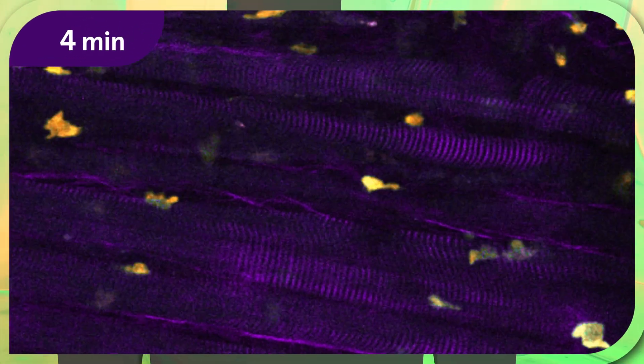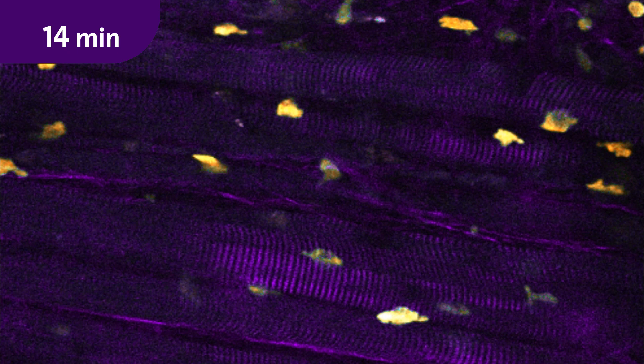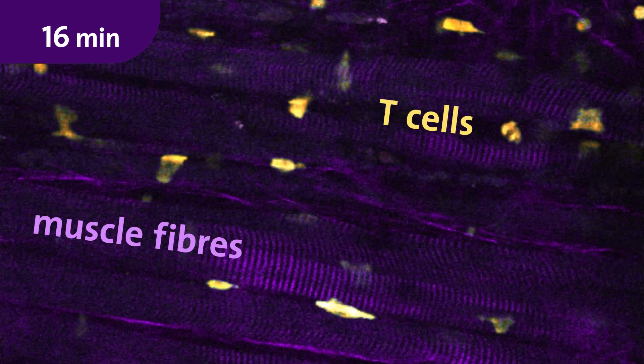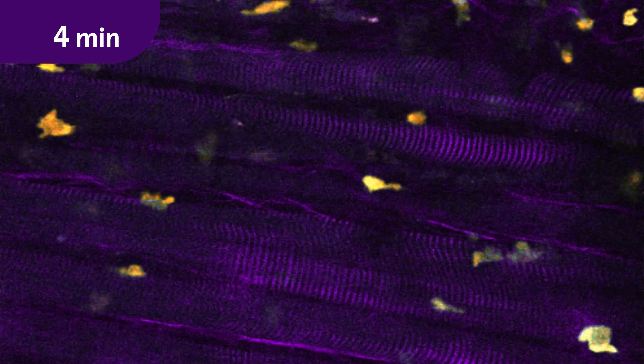In order to identify such threats, immune cells wander in large numbers through the tissue. Here, in time-lapse mode, we see T cells patrolling along the muscle fibers.